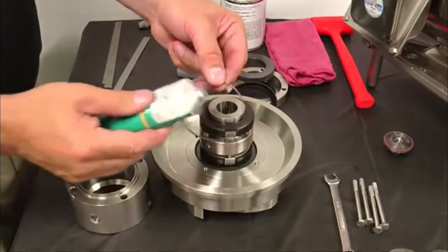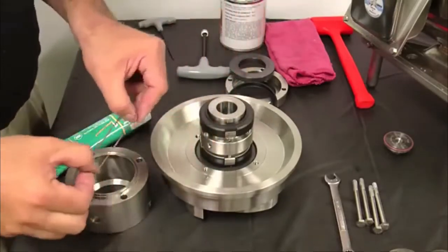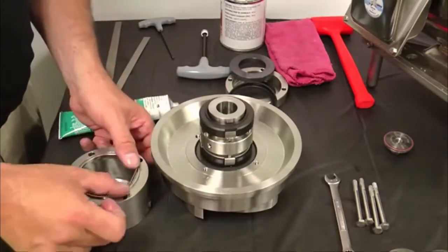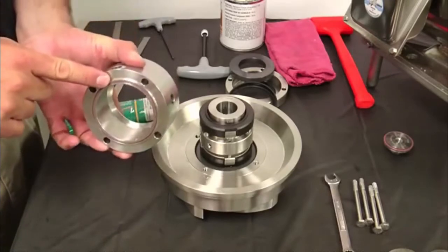Generously lubricate the seal housing O-ring — the lubricant is used to hold the O-ring in place when installing the flush housing. With the seal flush housing flush ports facing down, install a seal housing O-ring in the top side O-ring groove. You may need to stretch the O-ring to make it fit. Repeat the process for the second flush housing O-ring on the other side.